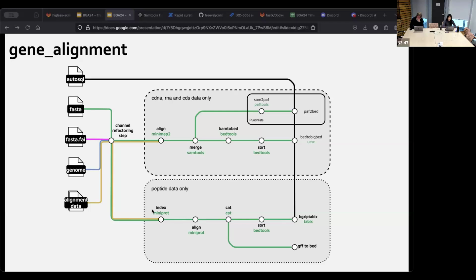Part 2, at the bottom, highlighted here, is protein sequence alignment, and it is actually a highly recommended step for genome corrections when annotating genes across different species. And yes, our curators do highly recommend using the protein alignment rather than the nucleotide sequence alignment.